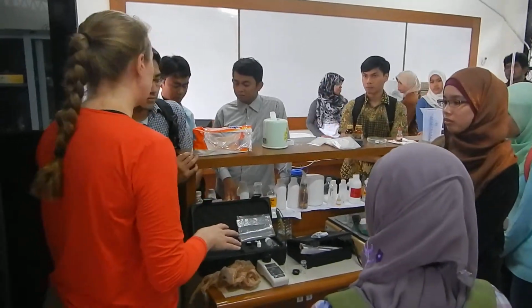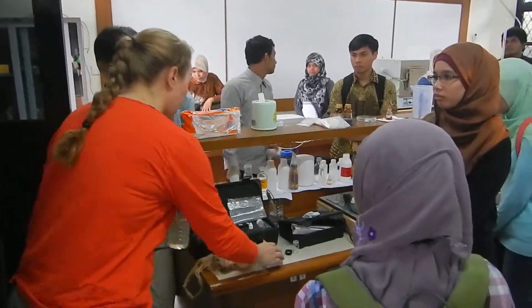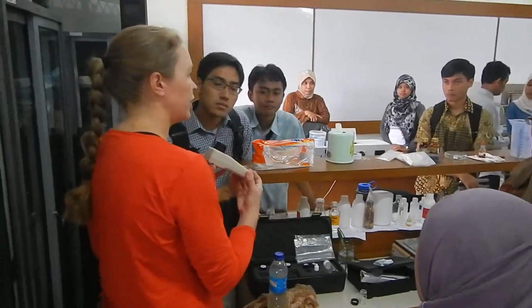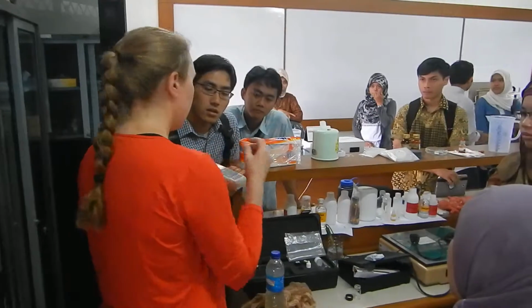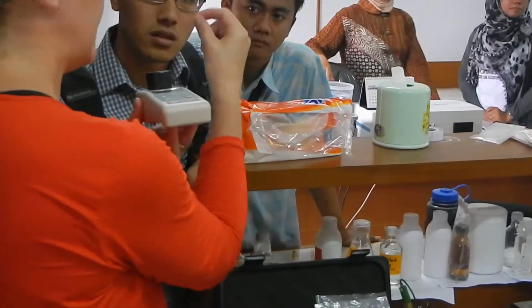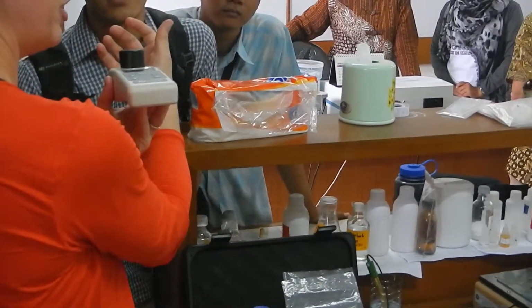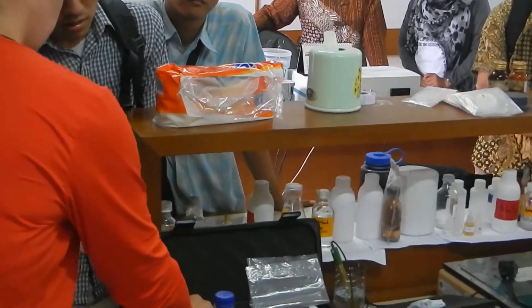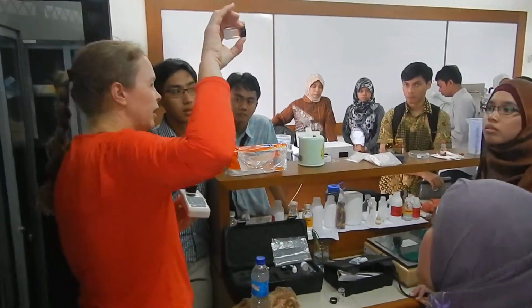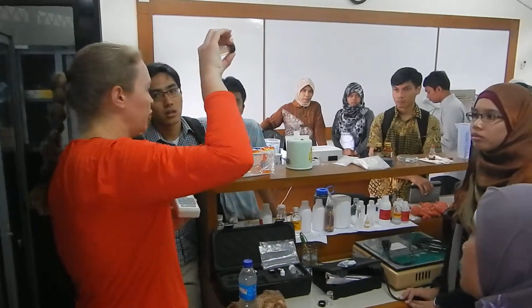Anyway, so turbidity is a nice, easy thing to do in the laboratory. It doesn't take a whole lot of time to do it. Most meters are fairly standard. Mine is a 2-point calibration. Theirs looks like it's a 4-point calibration. So basically, the way this works is it's going to pass basically like a laser across and say, okay, how much gets received? The less it gets received, the cloudier it is. So that's kind of why it's important to look at your standards. And they noted on here there's going to be a date on the standards for which they're applicable. If you're expired, it's good to go ahead and redo it.